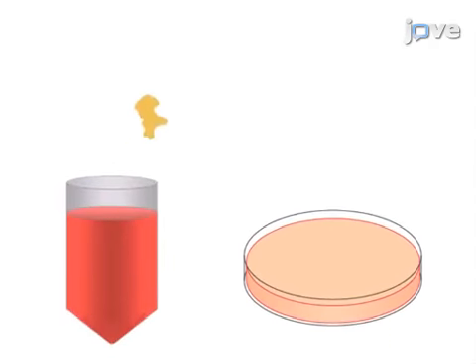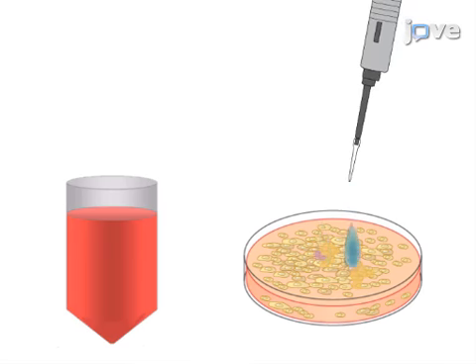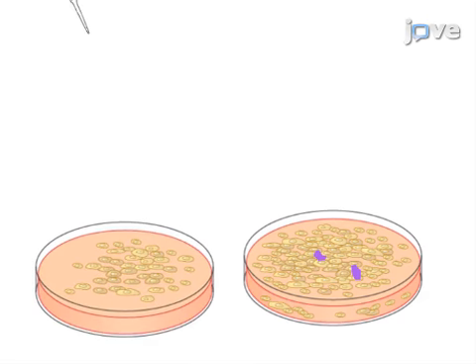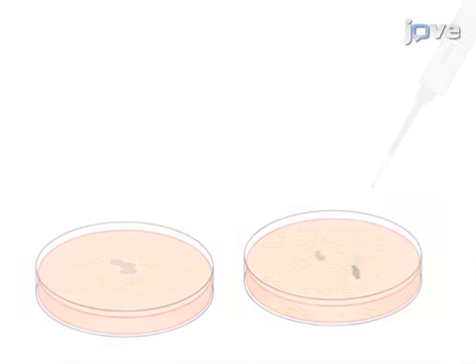The second step is to either let the human embryonic stem cells form embryoid bodies, in which they can generate cells of all three germ layers, or differentiate them into neuroectodermal progenitors. Next, the embryoid bodies, or neuroectodermal progenitors, are treated with compounds of interest at different concentrations during differentiation.